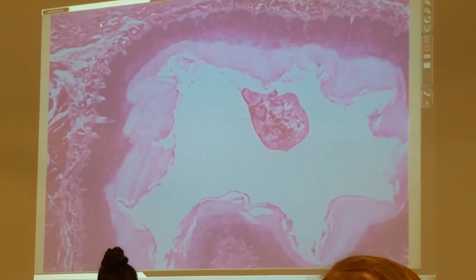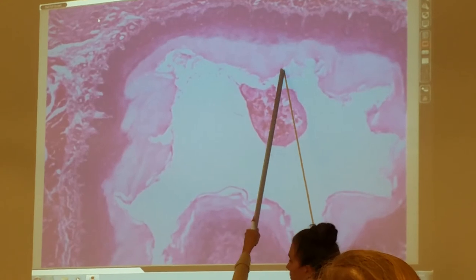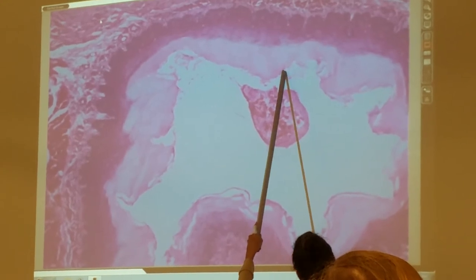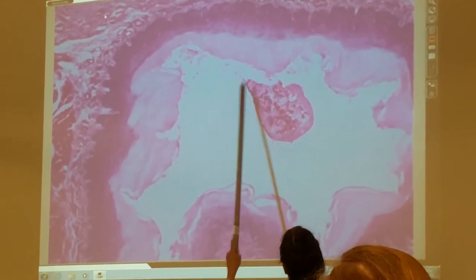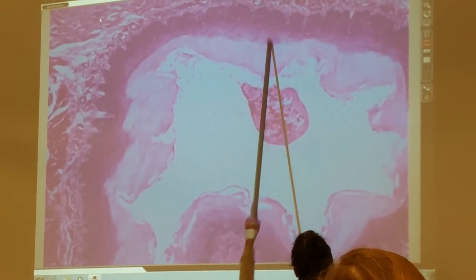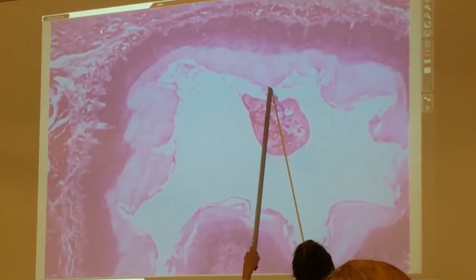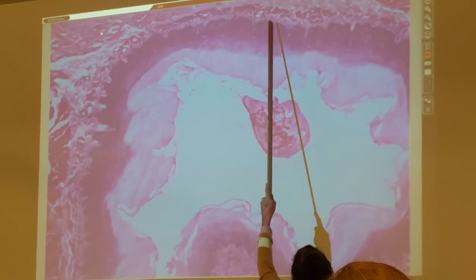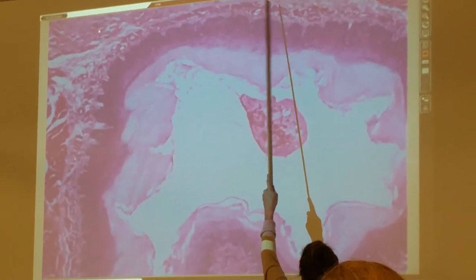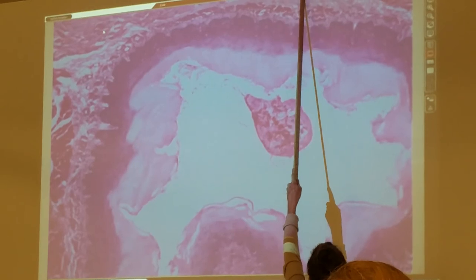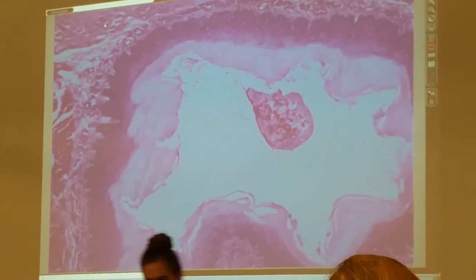So the stratified squamous epithelium would be right here — all of that, all the way to the lumen. This is stratified squamous epithelium, non-keratinized. And then the next part would be the lamina propria — that little bit of lamina propria, muscularis mucosa, submucosa, circular and longitudinal beyond that.